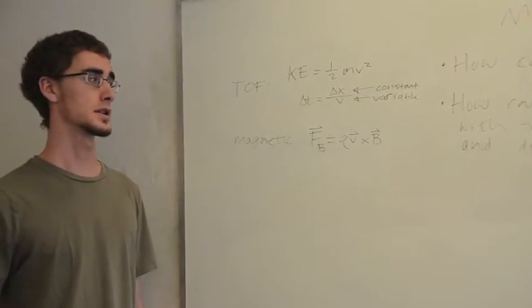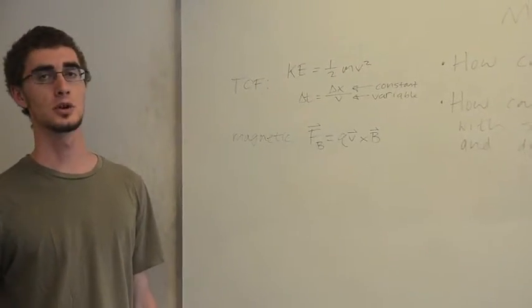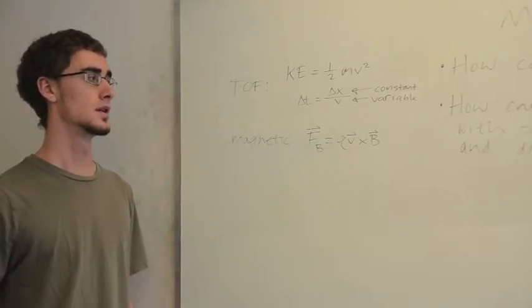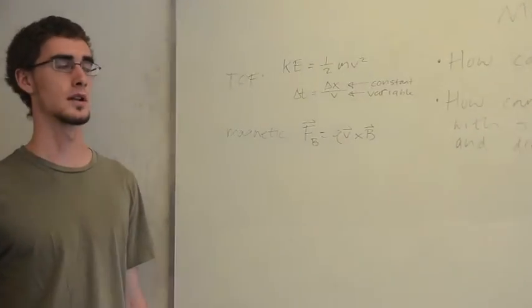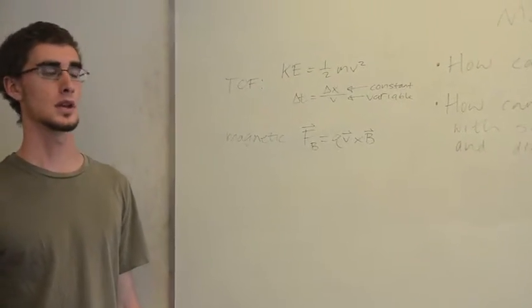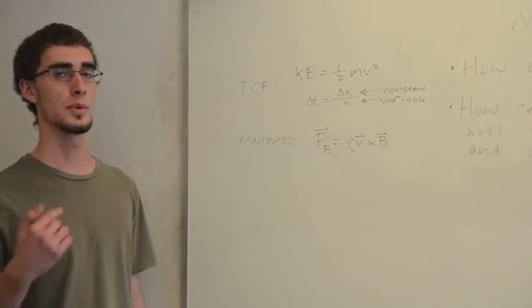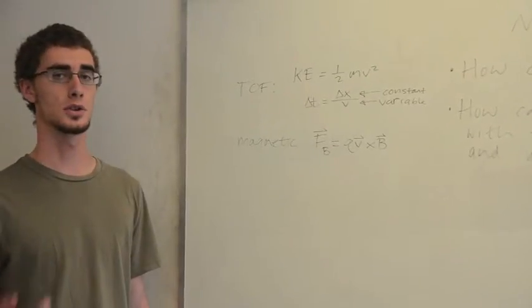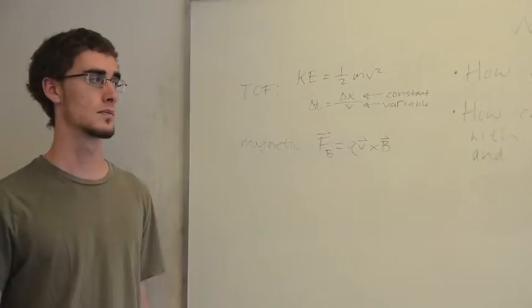The magnetic sector technique relies on the interaction between electricity and magnetism. When a charge is moving through a magnetic field, it feels a force that is orthogonal to both the velocity of the charge and the magnetic field. If you set up a curved pathway, then only certain particles will be passing through that pathway based on their mass to charge ratio. And you can tune which particles will pass through based on the magnetic field strength.